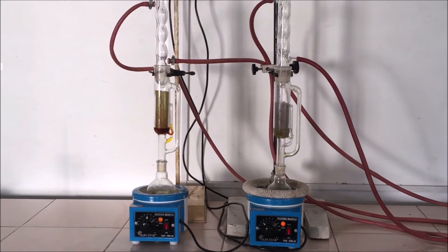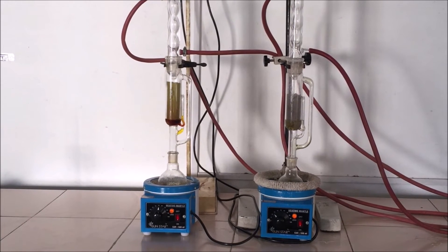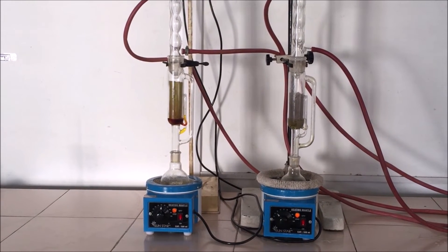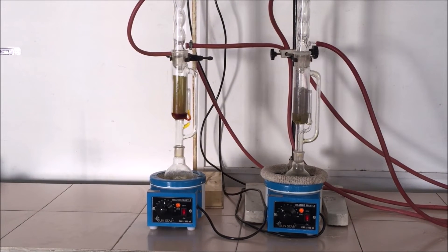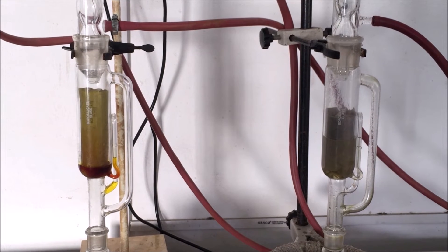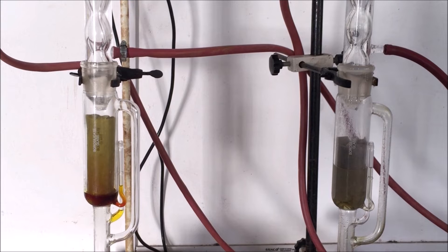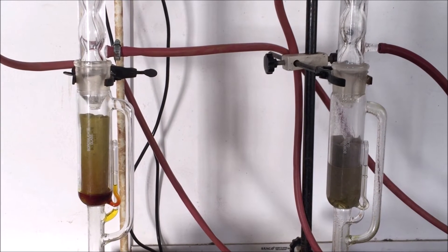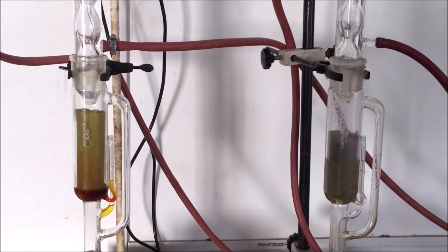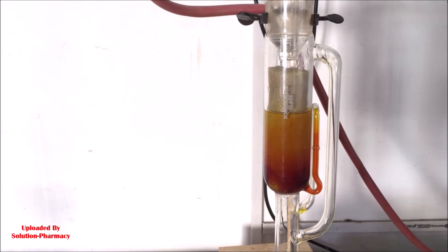Similarly, we have set up one more assembly — you can see it on the left side. We have taken turmeric powder inside the thimble and used ethanol as the solvent. You can set up two or more assemblies at the same time by connecting one end of the outlet pipe of one assembly as the inlet for the other. Here you can clearly see the coloring matter present in the drug getting dissolved in the solvent and extracted out from the drug.